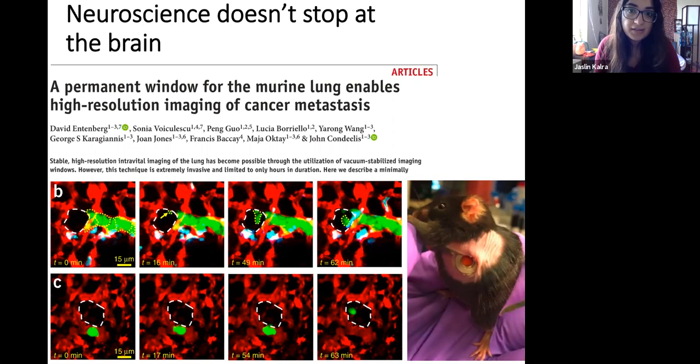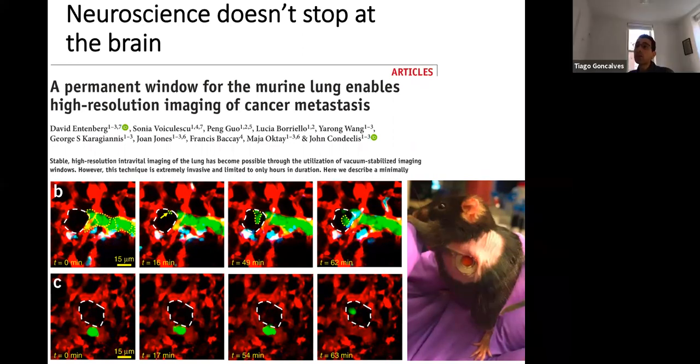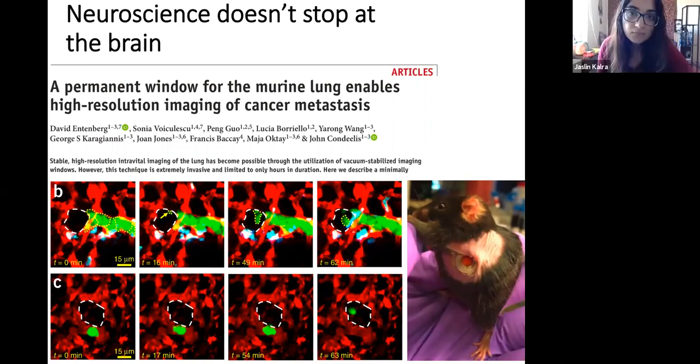Do they get hyper? Yeah, that's why I had this slide where I said you really do need the controls. For example, we image in the hippocampus. One well-known effect is that if you start ablating cortex and removing parts of cortex, you can get hyperactivity. You just put a mouse in an open field, and you start seeing that the mouse moves more.